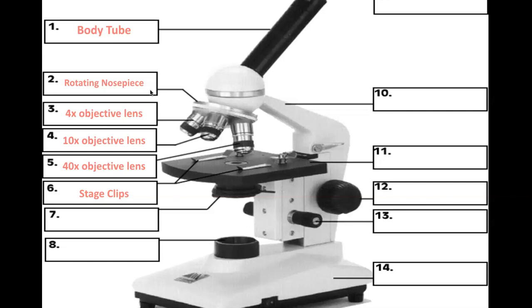You need to figure out which direction is the well, which direction is the divot. You are going to situate it so that the divot is facing up towards the ceiling. You're going to take a single drop of water and drop it in that divot. You're then going to take your second slide, your flat slide, and lay it over top. We call this a wet mount because the water is still in between those 2 slides. We're making a sandwich of water and whatever goopy, yucky, nasty stuff you got from your water sample last week.